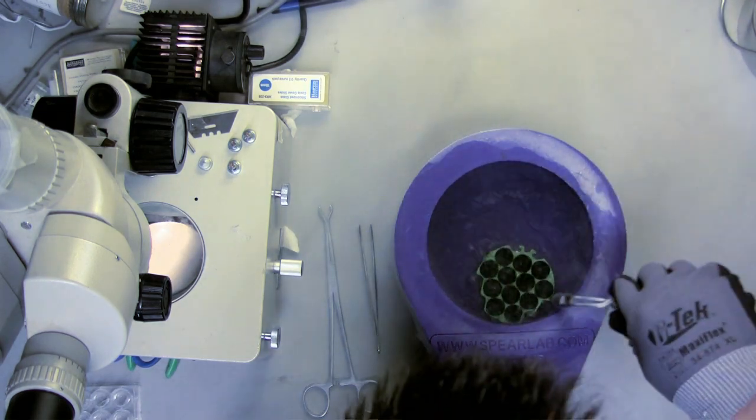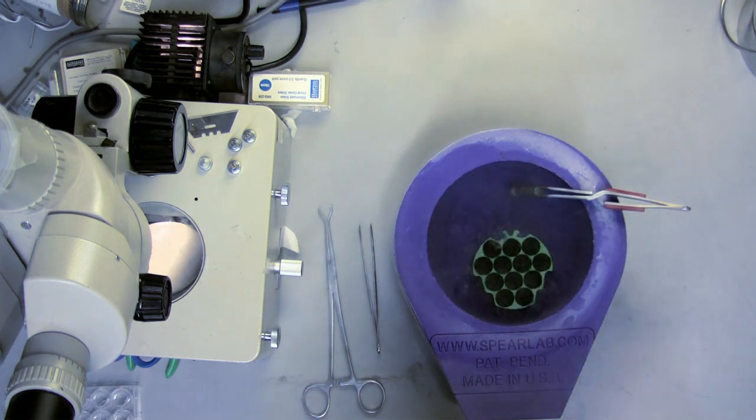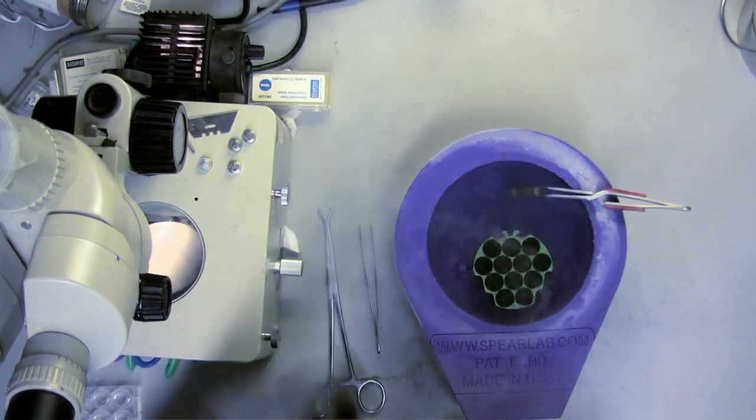This first method shows the use of Rigaku cryotongs to load samples into the pucks. Always ensure that the puck and tongs have been chilled down before use.